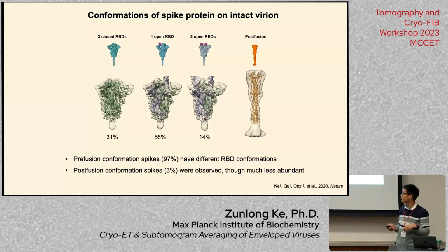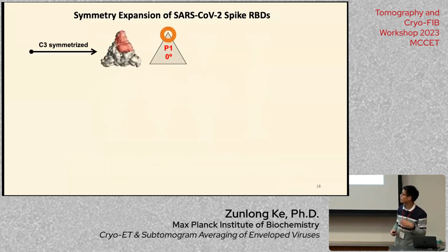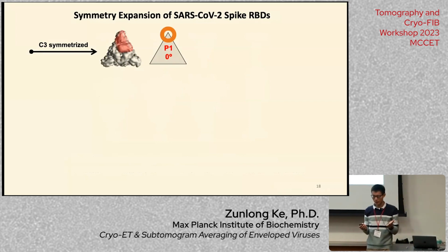That's after membrane fusion. I just want to go over this step really quickly, which is how we do the classification of this receptor binding domain region. Up to this point, we got 7.7 angstrom structures, and we assumed it is a threefold symmetrical protein, right?